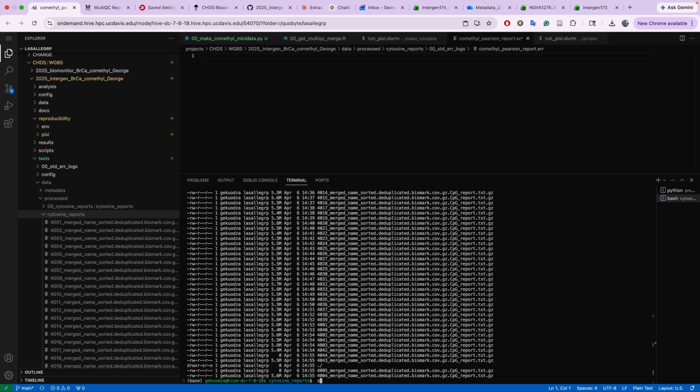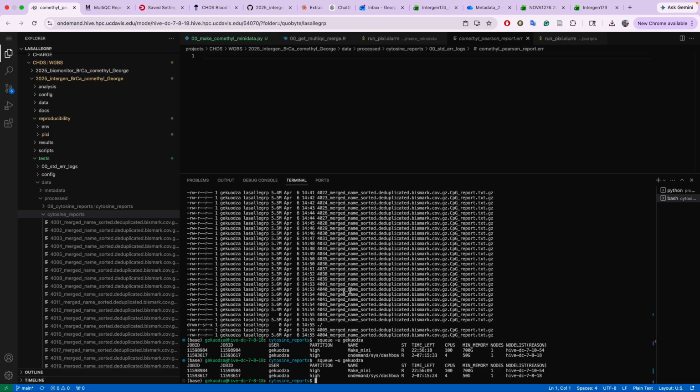Alright, let me just double check if this job is still running. Did you get an email, by the way? Oh yeah, about the job. Yes, so it queued 00 time and it's running. Okay, so that is running, the one that we just submitted, but nothing's happening just yet.